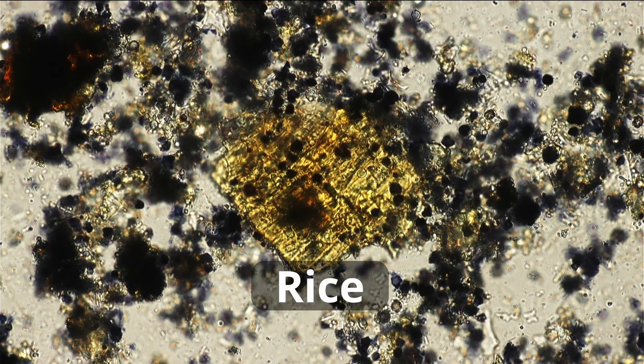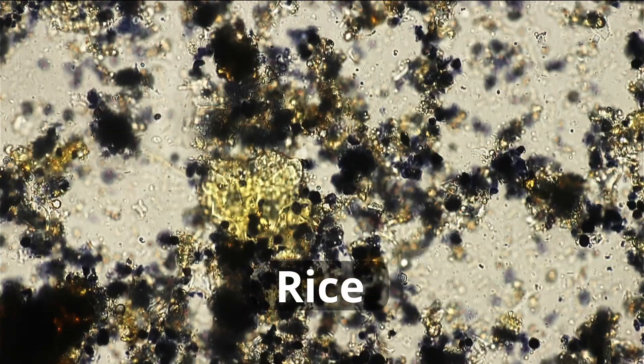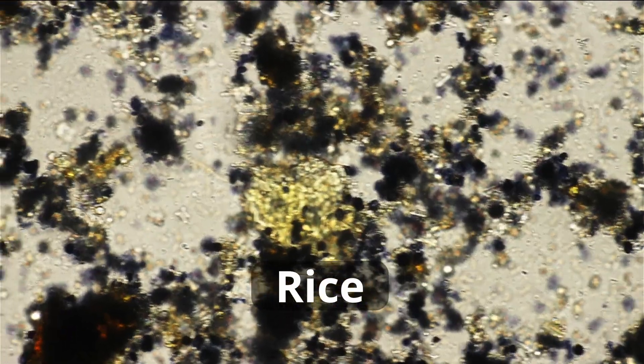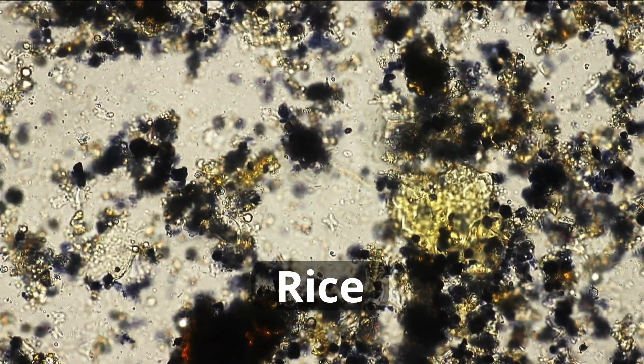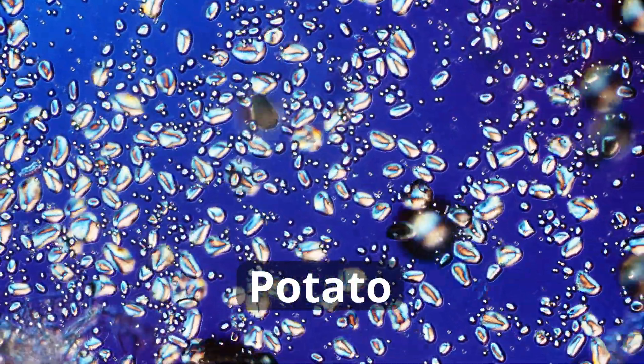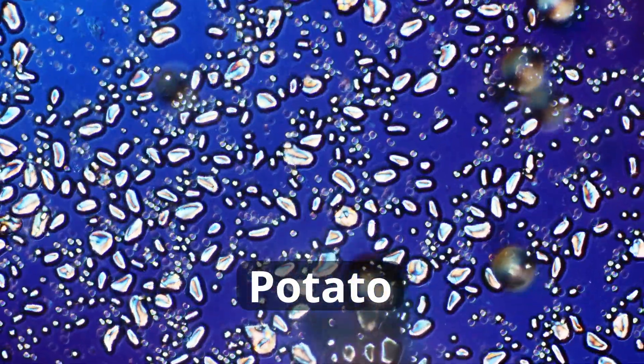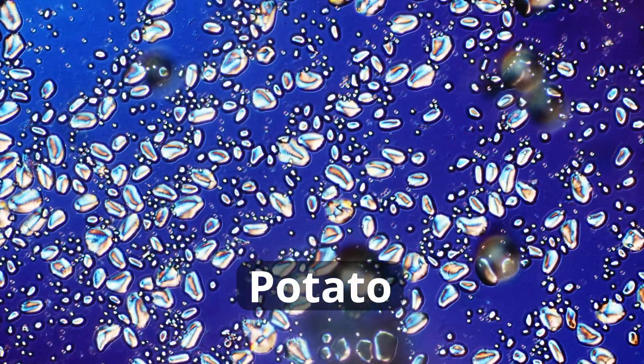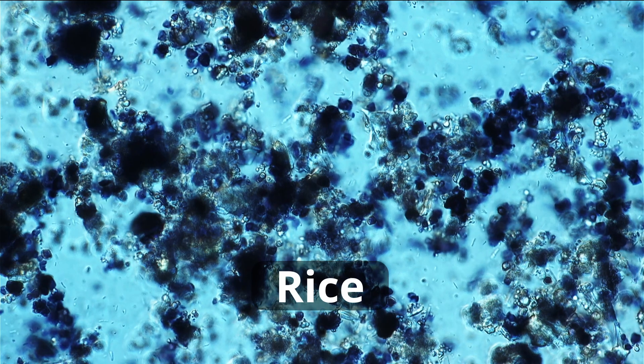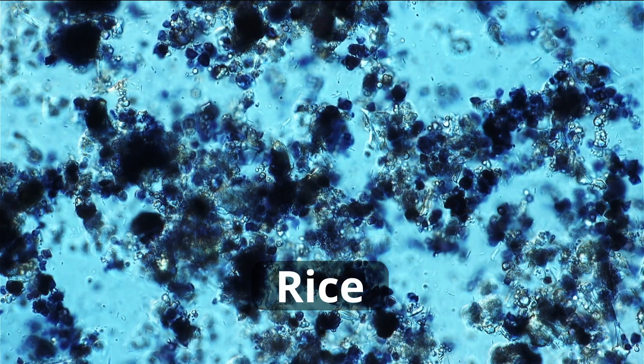And essentially, I was a little bit disappointed at the beginning because I expected some nicer starch grains. The starch grains of potatoes, for example, they look really nice and regular and actually not so much here. Very irregular, fragmented, but in any case, they're present, a little bit like I expected.